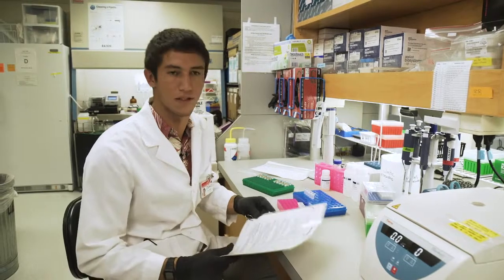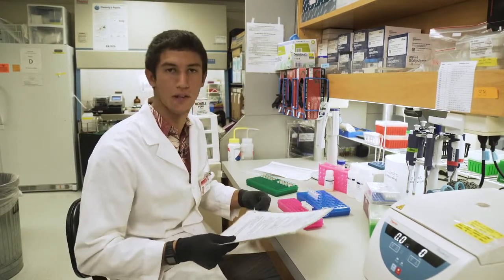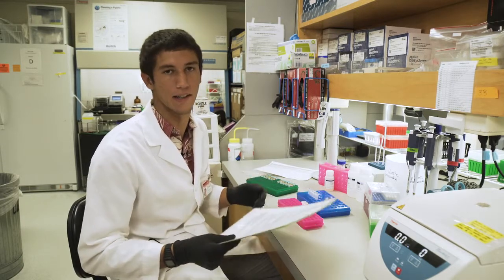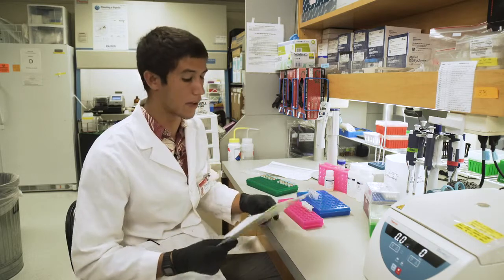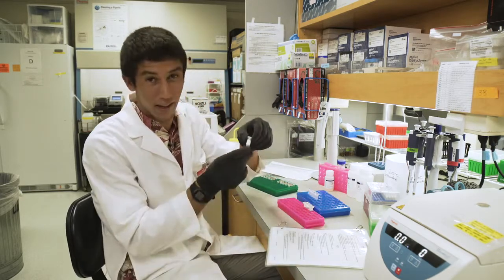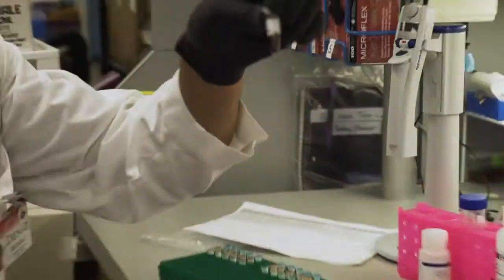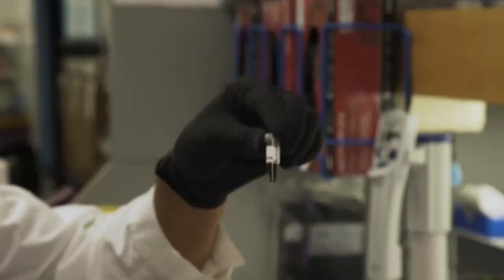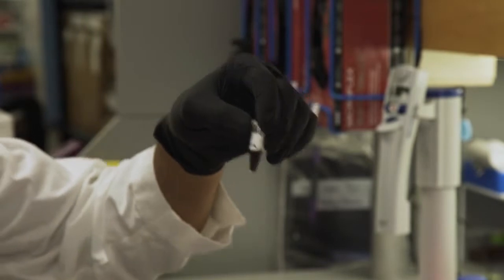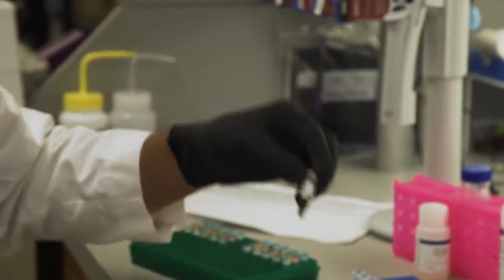Hi, my name's Dennis. So what we're doing here is we're finishing up the DNA extraction that you just saw. What happened was we did the overnight DNA digest for the slug tissue. And now we have these tubes here, and you can kind of see they're a little dark and funky looking. By the end, they should be nice and clear. All this dark stuff and a bunch of other things you can't see in there are the things we're trying to remove so that we only have the DNA left.